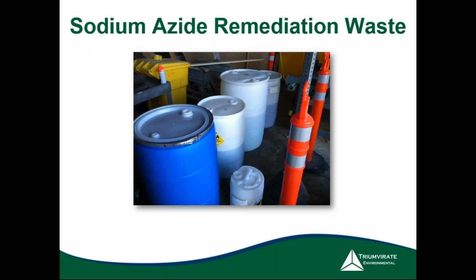So each one of those waste streams is collected individually, because if we were to mix them, we would have a pretty serious reaction with sodium hydroxide and nitrous acid. So we collect each one individually into DOT-approved containers, label it as needed, manifest it, and get it out. So we do a complete waste removal of the sodium azide remediation waste after the work is performed.